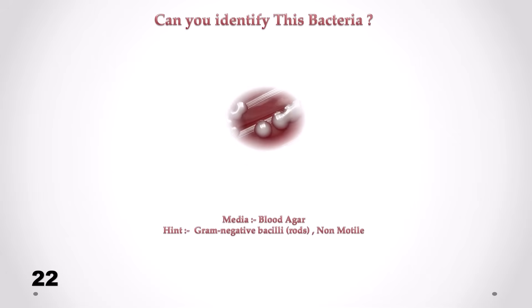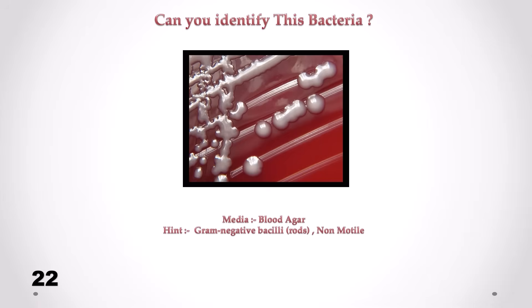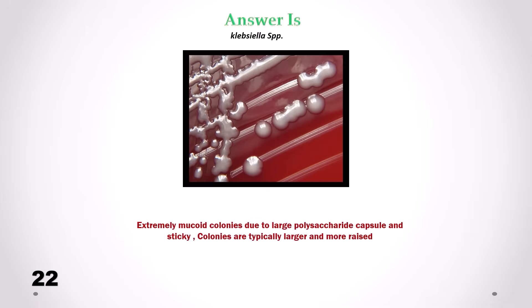Can you identify this bacteria? Correct answer is Klebsiella. We can see extremely mucoid colonies due to large polysaccharide capsule and sticky. Colonies are typically larger and more raised.